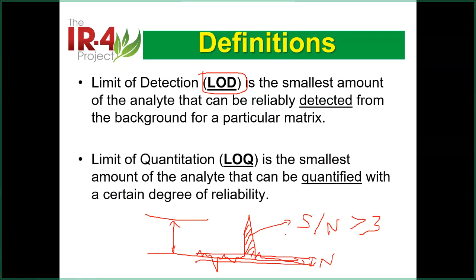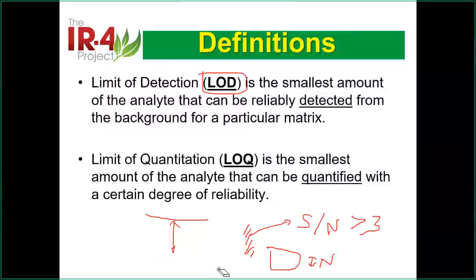Okay, so this is by science definition, but how you calculate that depends. If you select this part as your noise, it's different. If you select this part, it's different. So it depends on definition, but scientifically, this is the way. Because of this reason, the calculation will be totally different everywhere.